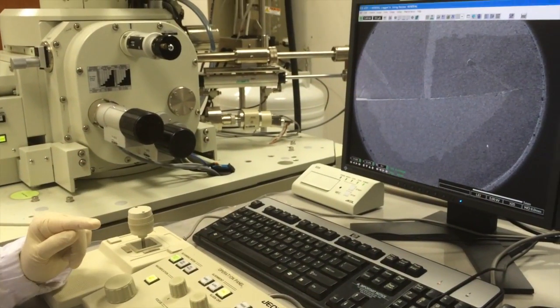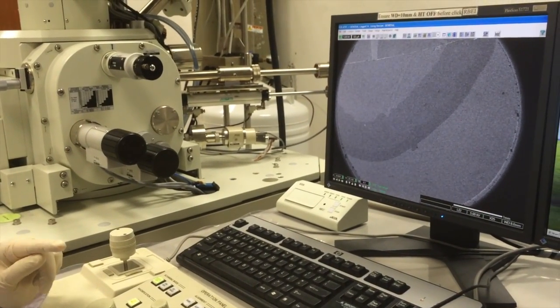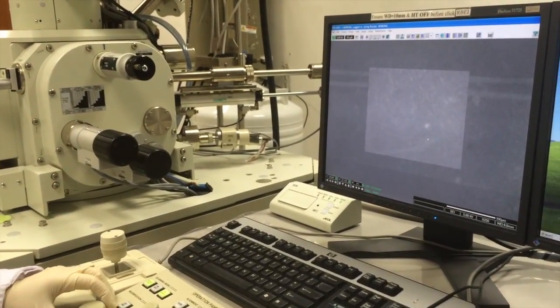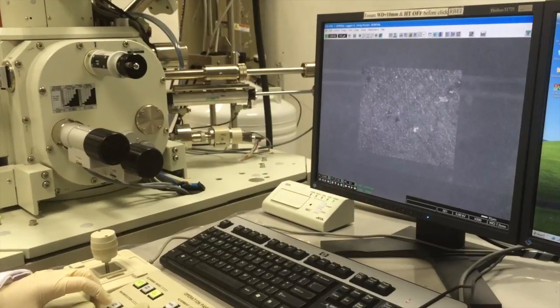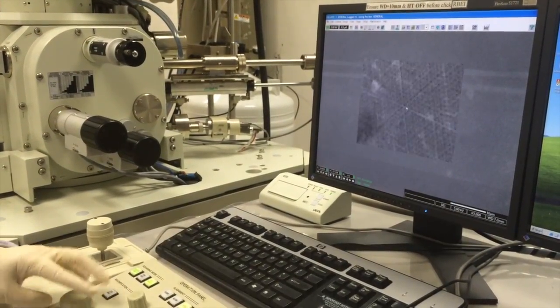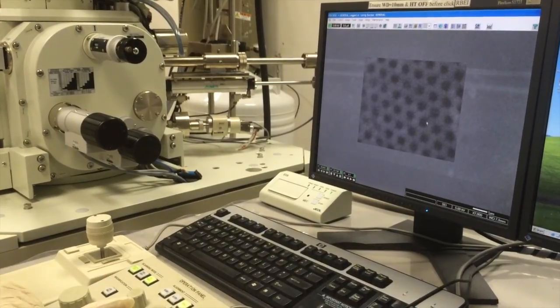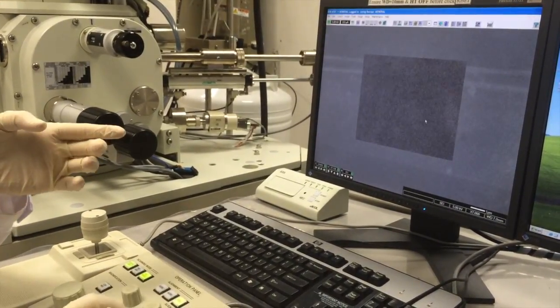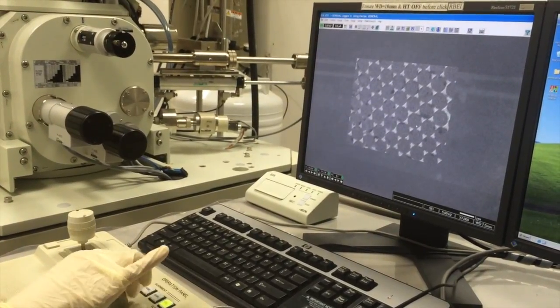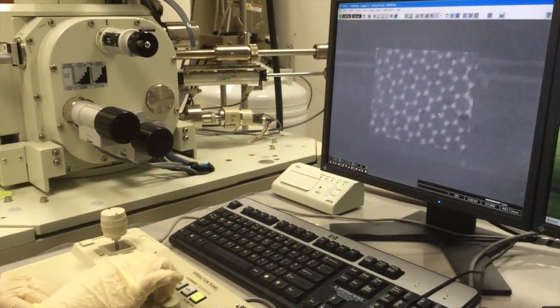Once the sample is in, a small window will pop out, which indicates the vacuum in the chamber. Wait till the vacuum in the chamber is 9.63 times 10 to the power minus 5, or at least 1.91 times 10 to the power minus 4 pascals. Check the color of the HT button. It will change from black to blue, indicating that it can be turned on, and green when in operation. This will turn on the gun emission. Wait till the emission current reaches 10 microamperes.